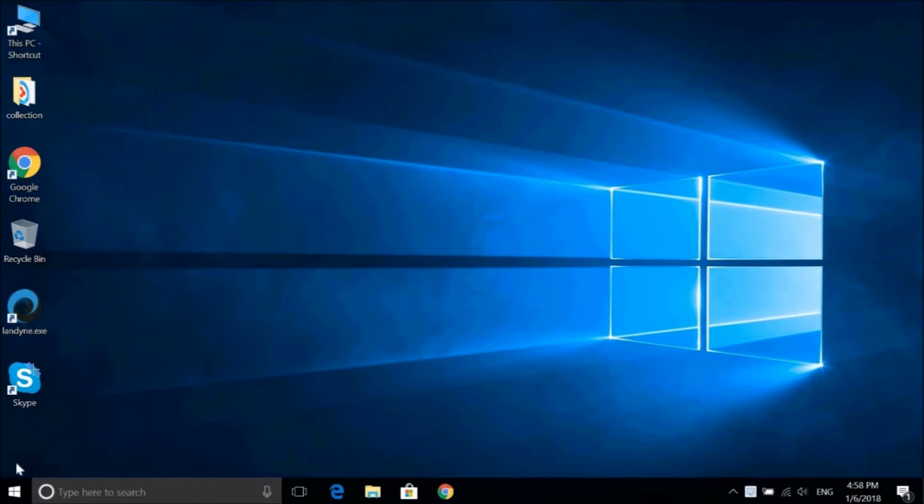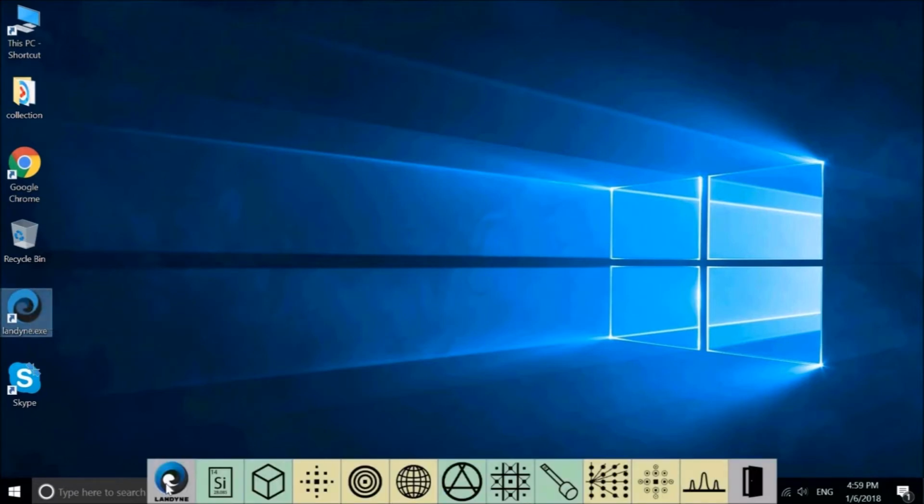We already explained how to download and install the Landyne suite together with the Java runtime environment and the Java Advanced Imaging system in the first video of the series. You may follow the video to download and install Java and the Landyne suite on your PC. I assume you have the software suite already installed on your PC, so you should have this icon on your PC. Double-click this to start the launcher.